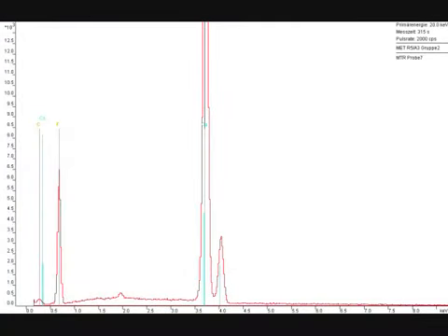Well, now for something very special. What you can see here is obviously calcium fluoride with a large, incredibly large peak at calcium and a clear fluoride peak to the left of it. But you can also see a little bump in the middle, between calcium and fluoride. That is quite a bit weird. It is not marked to be an element, but it's clearly a peak, so what is that?